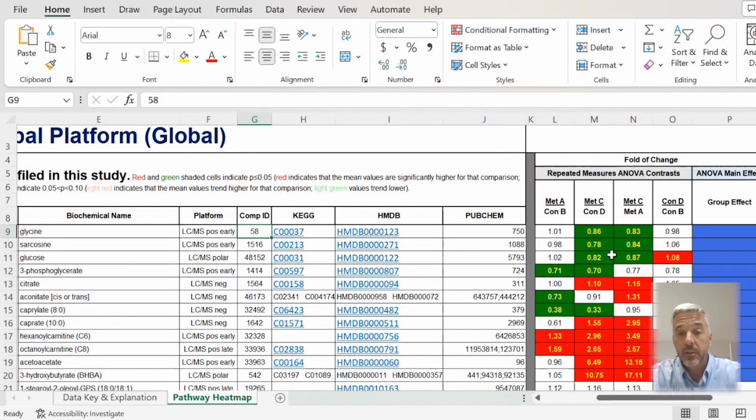The statistical comparisons are really going to be dependent on the study design. Our DTS team will consult really from the start of a study idea to understand what your objective is, help you design the study, attribute groups, and then we can have a discussion on the most appropriate statistics. We can do any number of statistical techniques. If it's simple two disparate groups compared to each other, it might be a simple Welch's t-test.